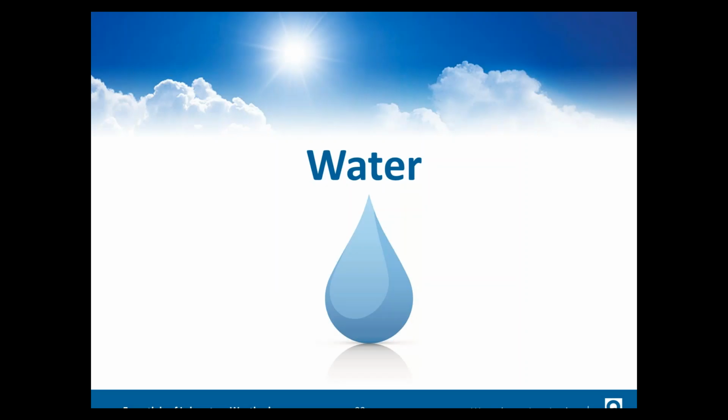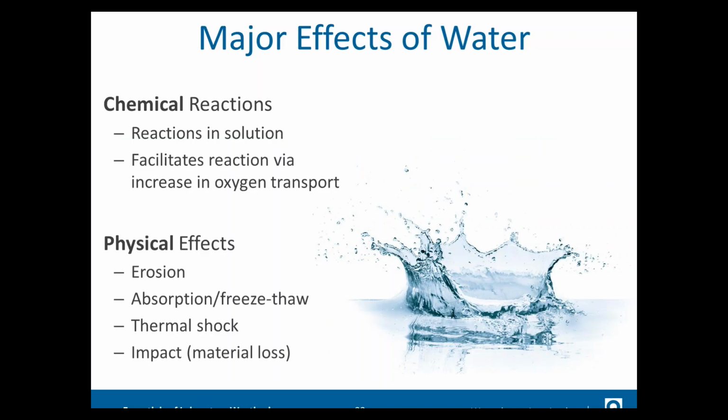The third and final factor of weathering that we're going to talk about is water. And this is probably the one that is the most difficult to simulate for accelerated laboratory testing, and probably the one that's least understood as far as the importance for long-term durability of materials.